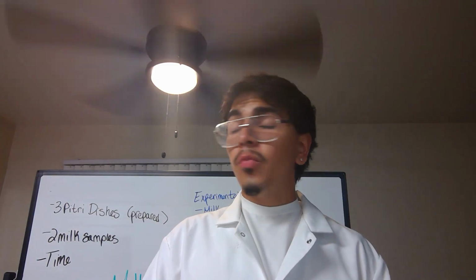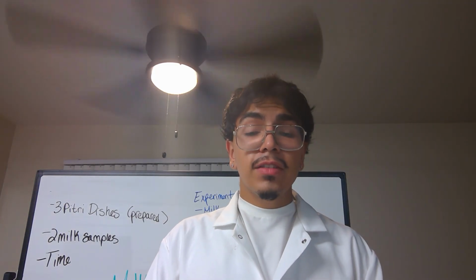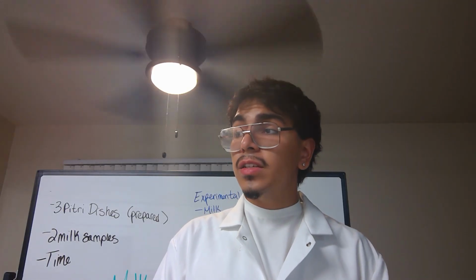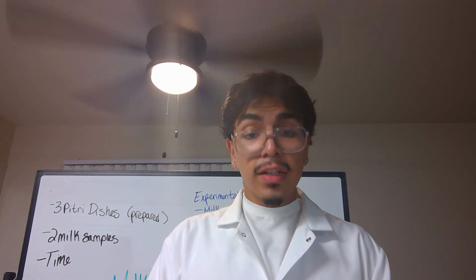It's for that reason that when I pour my sample into the petri dishes, I will hold my breath to try to keep as much contamination out as possible. Additionally, I've washed my hands as thoroughly as possible. Unfortunately, I don't have gloves, but I've done my best with what I have. So let's get pouring.